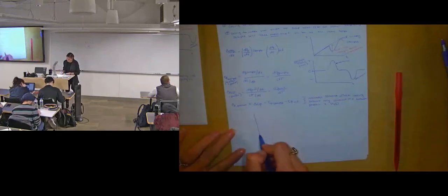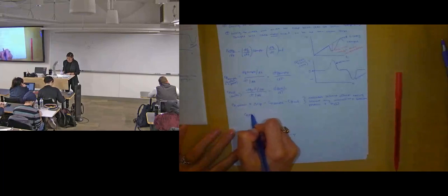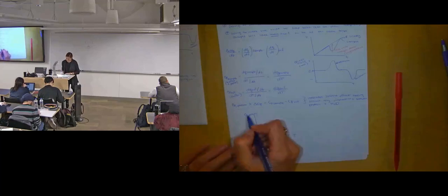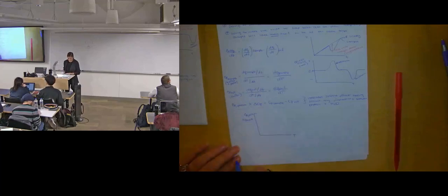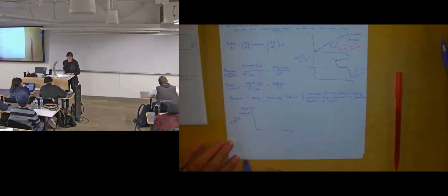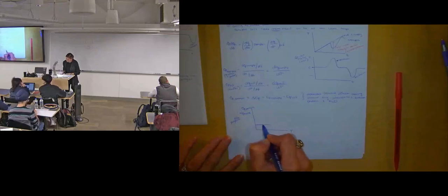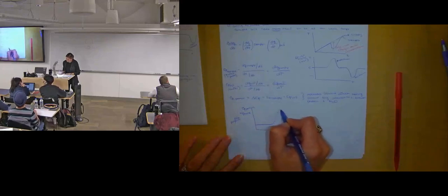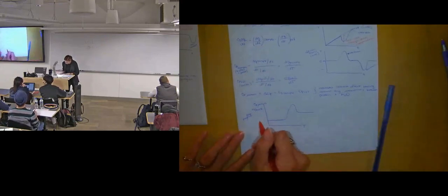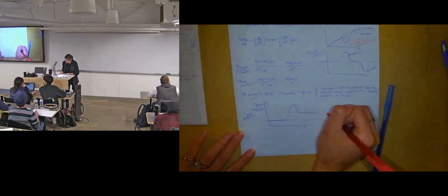Okay, and so this is the plot that we saw before, temperature versus heat capacity of the protein. Remember, this piece is actually this whole piece. It's really a difference between the two cells, okay, in kilojoules per mole Kelvin. So it's really a difference in CP between our two pans or cells, whatever you want to call them. And it looks something like this. We have the things all folded up neatly. There's this big piece. I've severely exaggerated this. So here's the folded protein. Here's the unfolded protein. Okay.